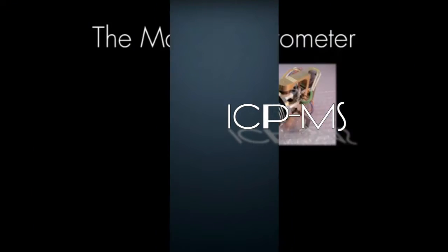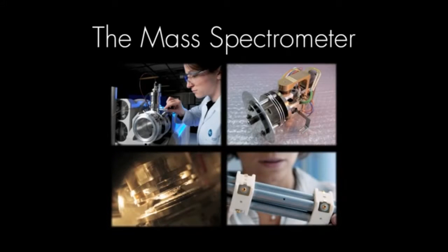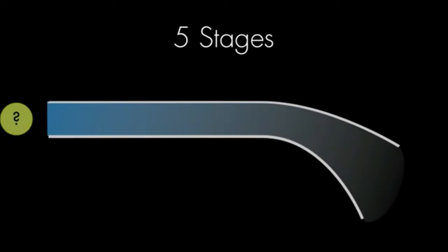vital instrument in many kinds of chemical analysis. But how does it work? And how do we interpret the data that we get from it? A mass spectrometer works in 5 stages.